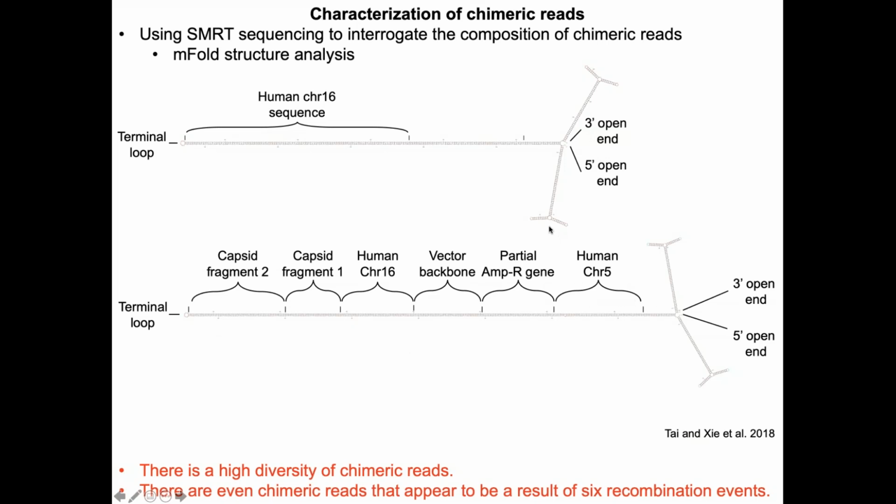So these chimeric genomes, although interesting, pose a little bit of a concern, at least in terms of potential safety. One is that we had imagined that these types of packaging events may probably be passive, but knowing that about 50% of these sequences have ITR sequences contiguous with the contaminating regions, these serve as an active mechanism for packaging via Rep-mediated packaging.